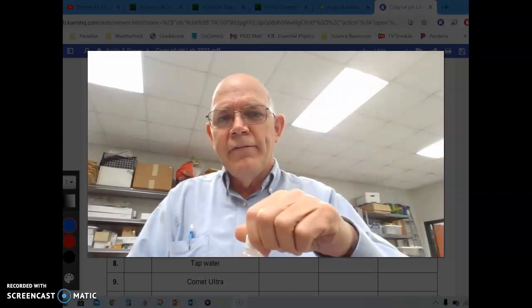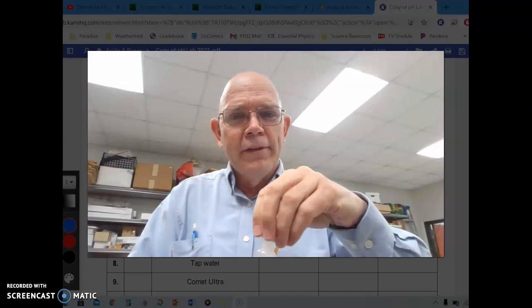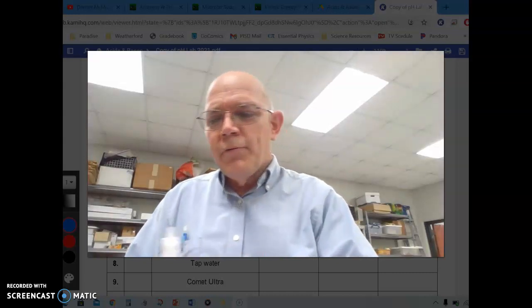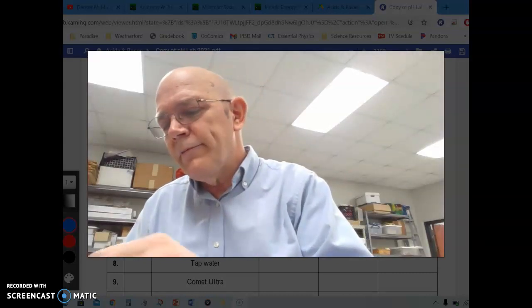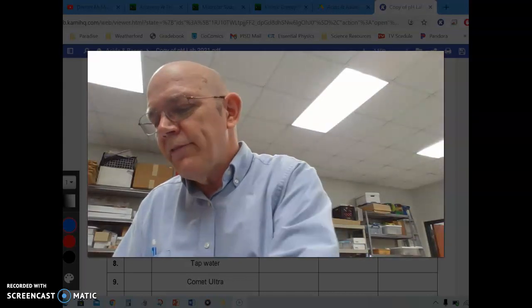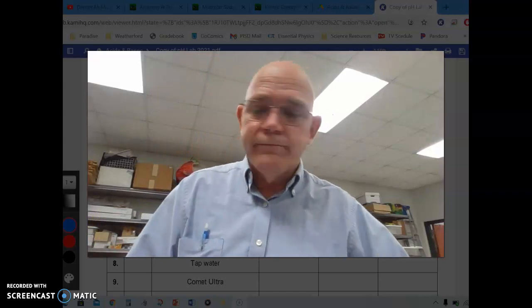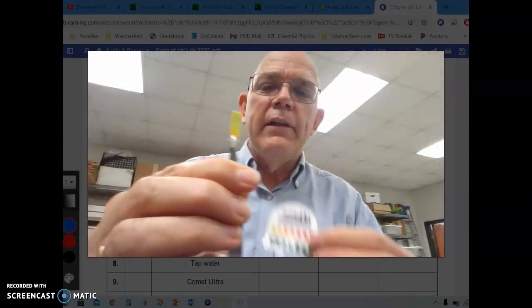Tap water just means out of the faucet. And just for the record, this is number 8 on your sheet. We're going to put a drop of water on there, and we've got to let it soak in a little bit. Give it a few minutes to soak in. And it looks about like that.